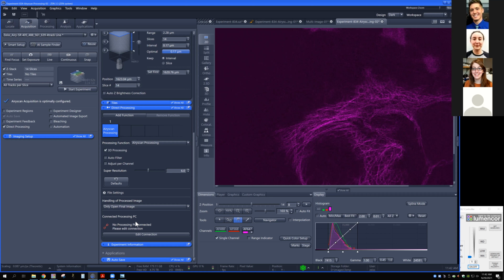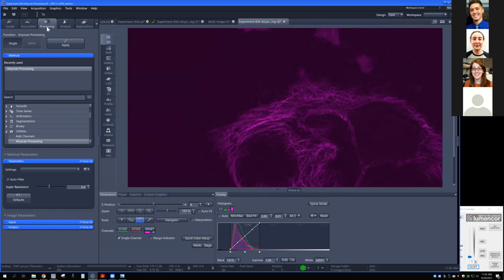Sorry, quick question about the batch processing. Can we also have options for the batch processing when we are choosing, for instance, I didn't see the auto cutoff for the signal and noise ratio. So could you? Yes, sorry, they were there. I just breezed through it, I guess.